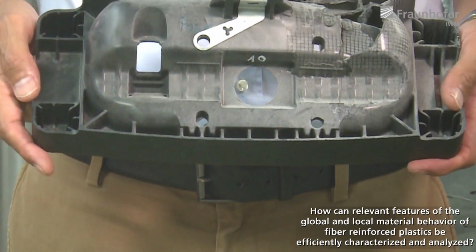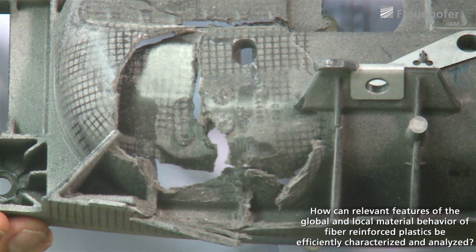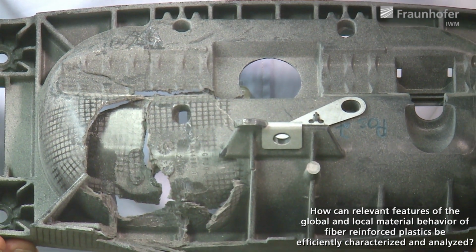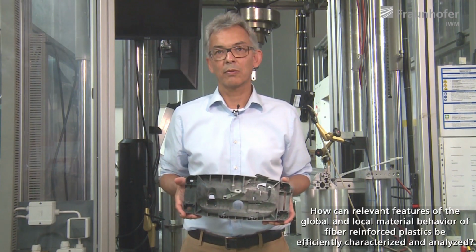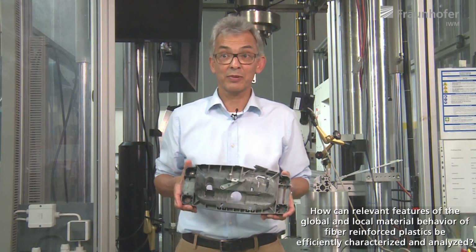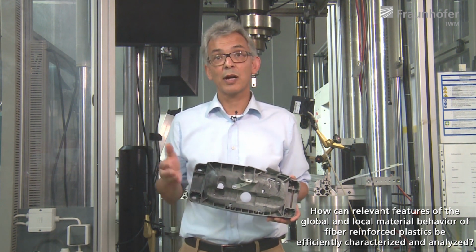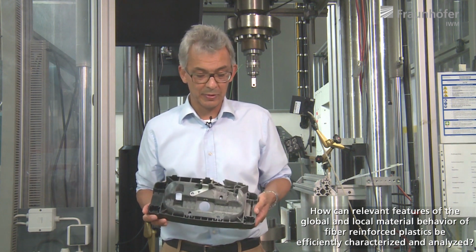If we have a close look at the component, we'll see that the material the component is made of is a fiber reinforced plastic. Actually, it is a polypropylene with glass fibers, the so-called LFT material. So why do we deal with deformation and failure behavior of such components in the first place? It's because we want to know about loading limits under which neither too large deformations nor failure occurs. So we want to establish those limits.